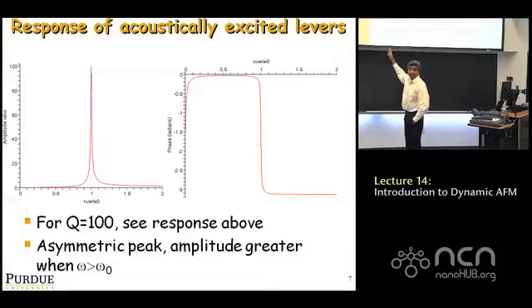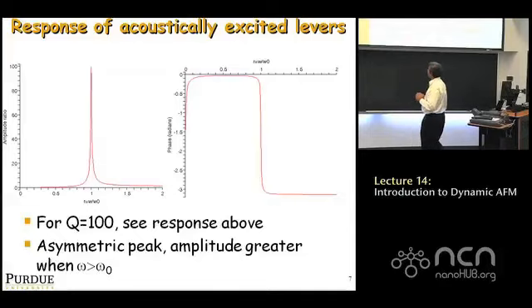Again, be very clear about the following fact, that wherever you choose the drive frequency to be, the cantilever always responds at the drive frequency. The cantilever does not respond at the natural frequency. However, the amplitude of the response does become large when the drive frequency equals the natural frequency, but it's always oscillating at the drive frequency. So the only indication you have whether you're at resonance or not is, you're shaking this and it's responding at the same frequency and you're measuring the amplitude and phase of this oscillator. The only way you know if your drive frequency equals natural frequency is if the amplitude becomes very high and if the phase becomes 90 degrees, that's all, okay? So it always vibrates at the drive frequency in steady state.